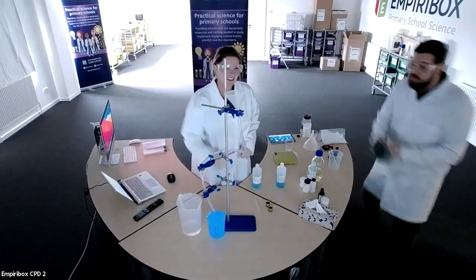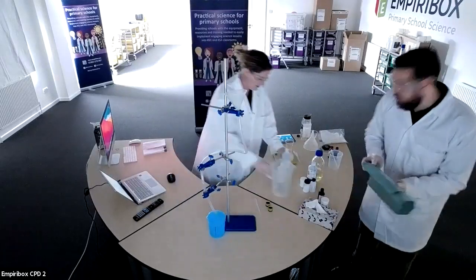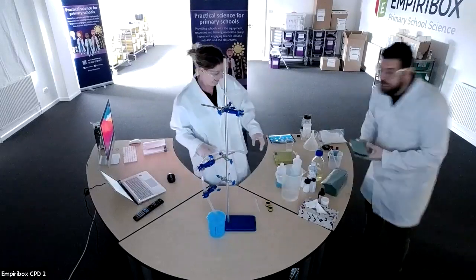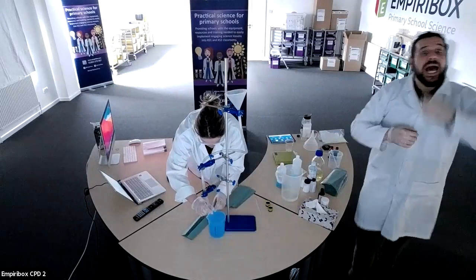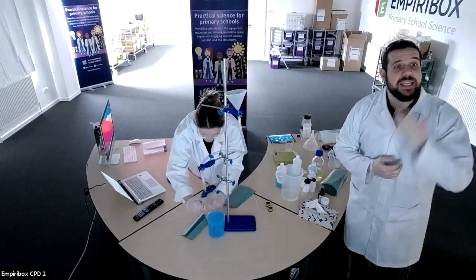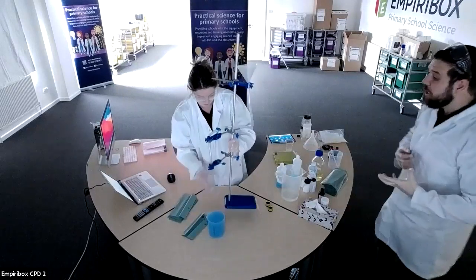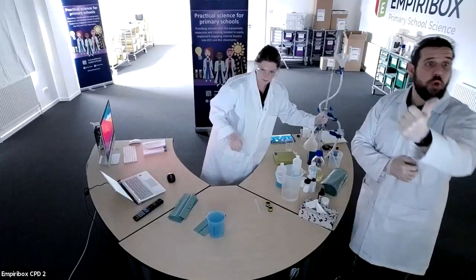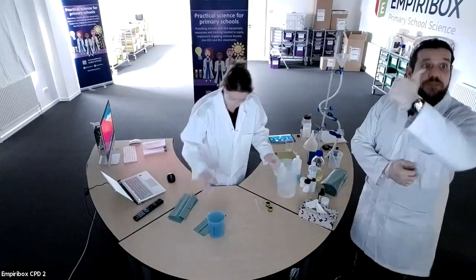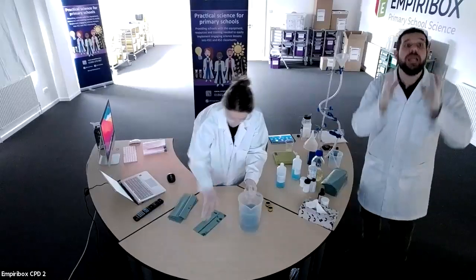So, boys and girls, I don't know if you can see, but we've actually got a little bit of a glow going on in that substance. That basically tells me that these two chemicals have reacted with each other. And one of the key things that tells us a chemical reaction has taken place is that light was produced. So we know that light was produced, and that's another key. So the first one we saw smoke, vapor. The second one we saw here, we basically see that light was produced.